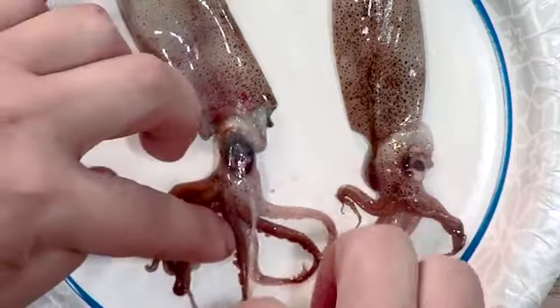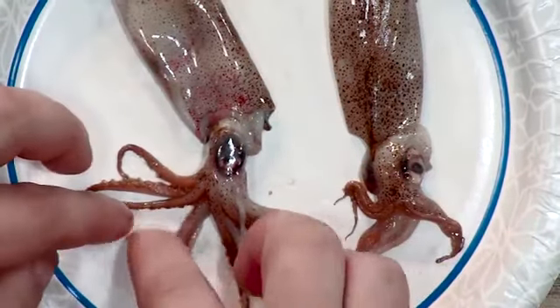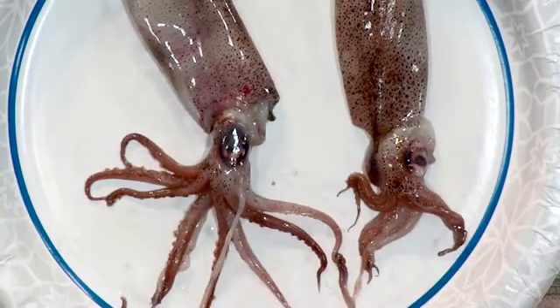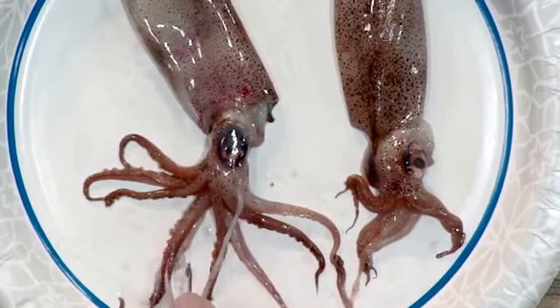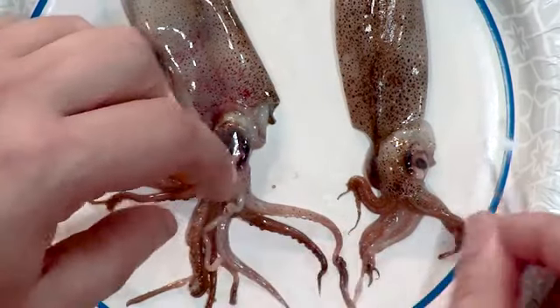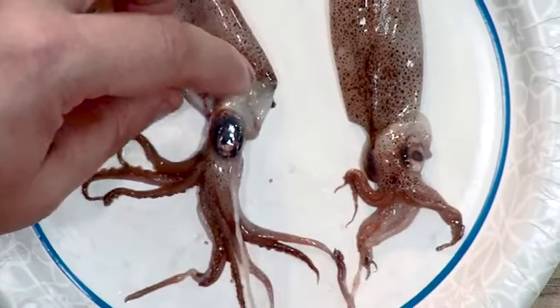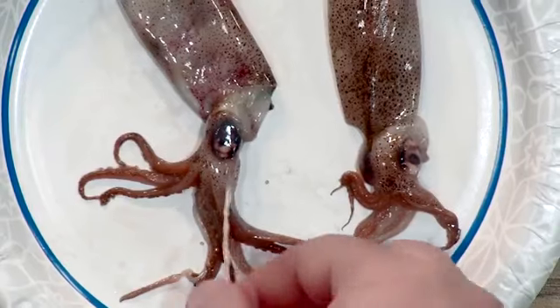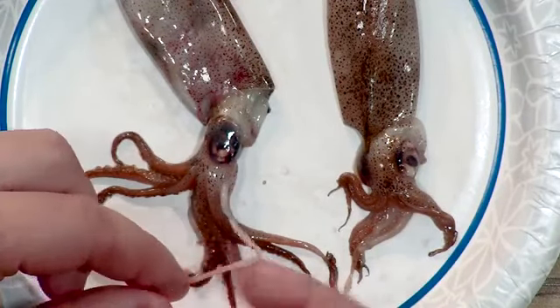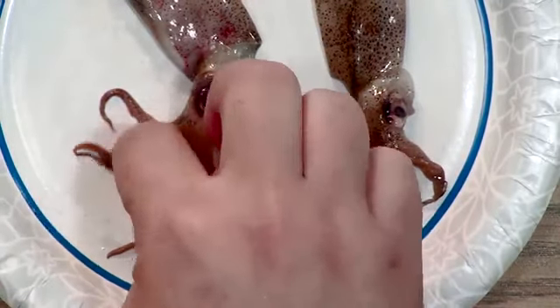Now, something that is unique about squid compared to the octopus is squid have the 8 tentacles, just like the octopus, that have the suction cups on the arms, but they also have these 2 other tentacles that are significantly longer than the other 8. These longer tentacles don't have suction cups on them until you get down to the very, very end. Pretty interesting.